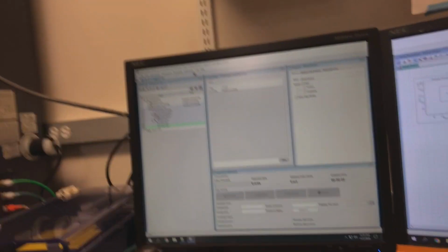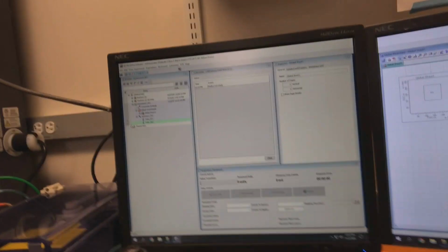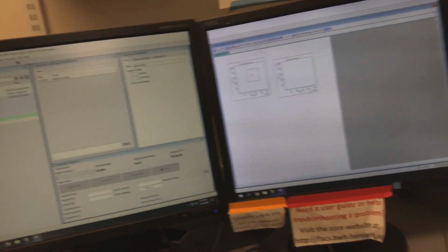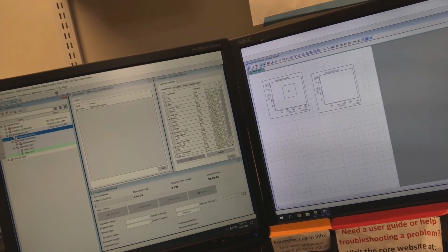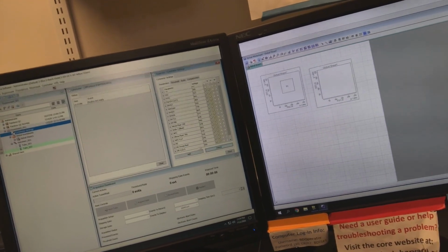The difference between this machine and the Canto 2 is that once we go into the next steps, you'll want to be ready to actually run your samples. So what I would suggest now is to create some of your gates and to go into the cytometer settings, choose your parameters that you wish to use, and delete the ones you are not going to use.